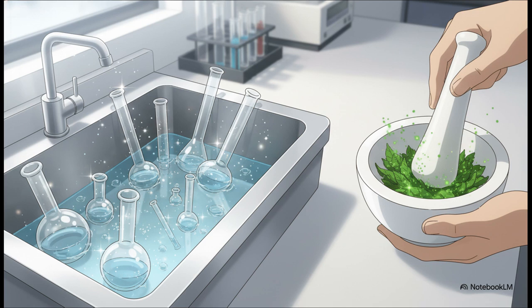We also meticulously prep our reagents. We're using things like 5% lanthanum chloride and 0.2% cesium chloride, which basically act as chemical bodyguards to prevent interferences and ensure zero cross-contamination. And meanwhile, the plant samples themselves are collected from the field, washed, dried, and ground down into a super fine powder.